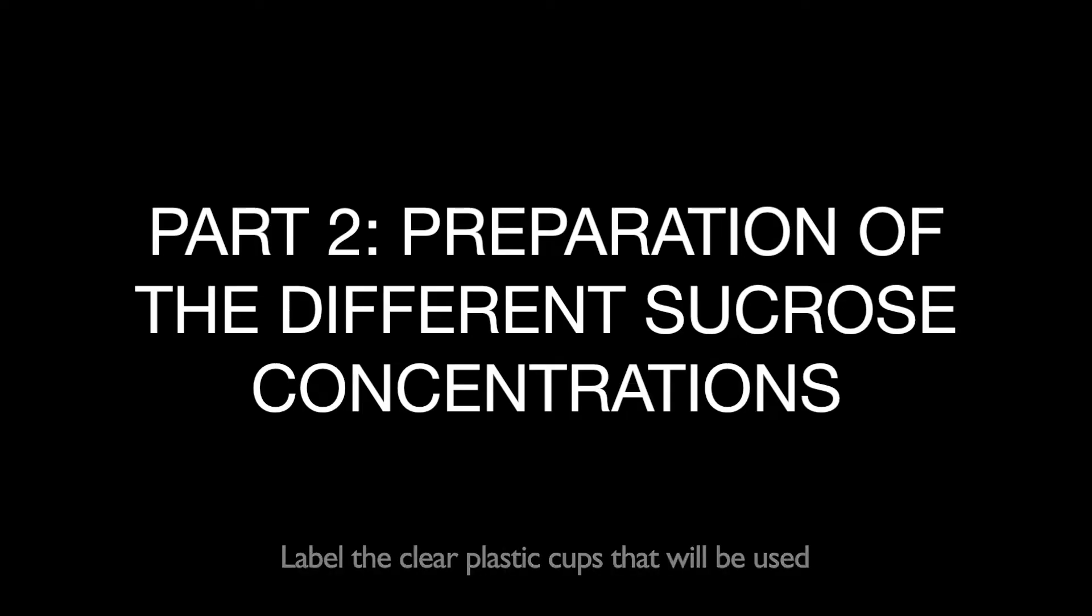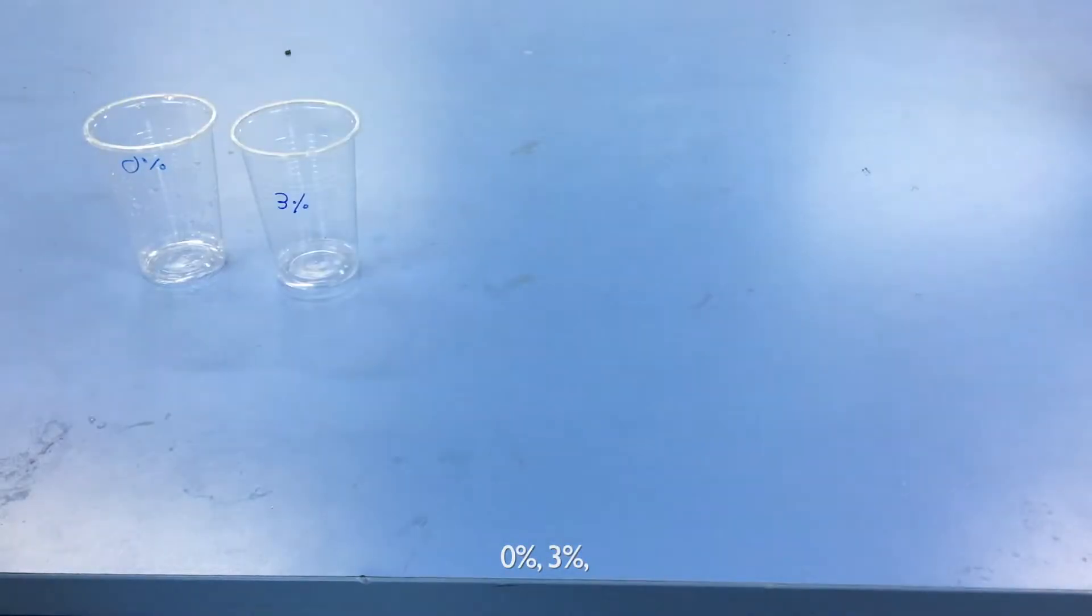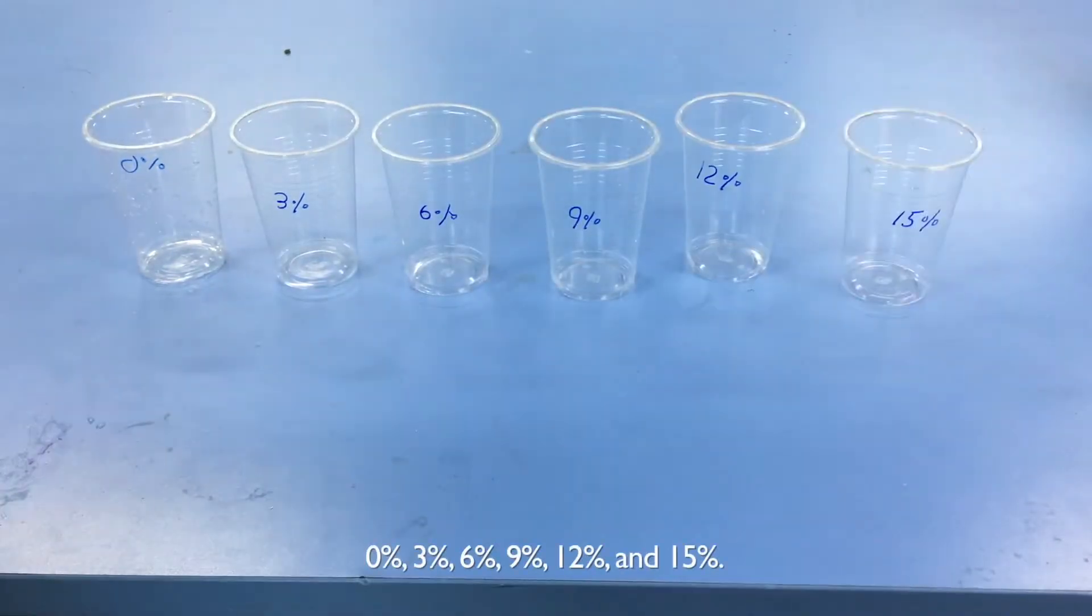Label the clear plastic cups that will be used for the 6 different sucrose concentrations: 0, 3, 6, 9, 12, and 15%.